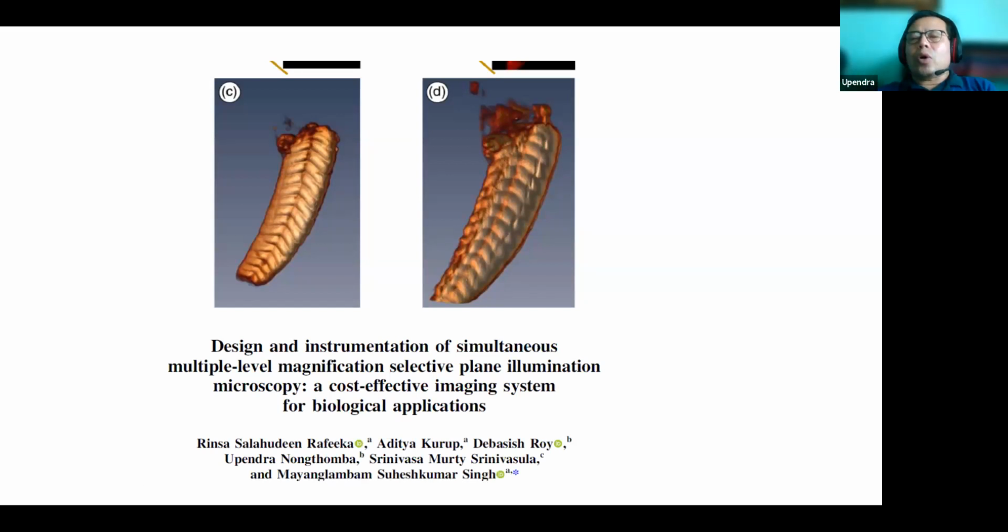The kinetics of most of these cells, right, when they move around, what happened and things. And luckily, I have Partha and Suez. They are helping me, because you can see it. This is the light microscopy which Suez took, and it is published. You look at the zebrafish, the whole body, right? Each septa of the muscles, they are so symmetrically organized.